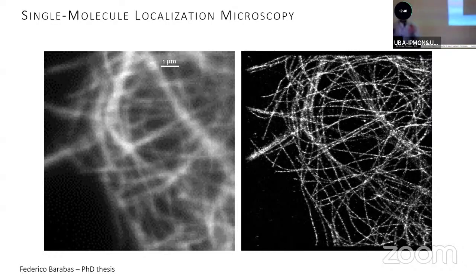Okay, so now you know how the 2 families of techniques work, right? So one is switching molecules on and off with light, usually implemented in a scanning microscope. You need to scan that pattern on your sample. The other is a wide field technique. You don't need to scan anything. You just illuminate, let the molecules blink, and you can do the same thing. Both families can be extended to multicolor and to 3 dimensions.